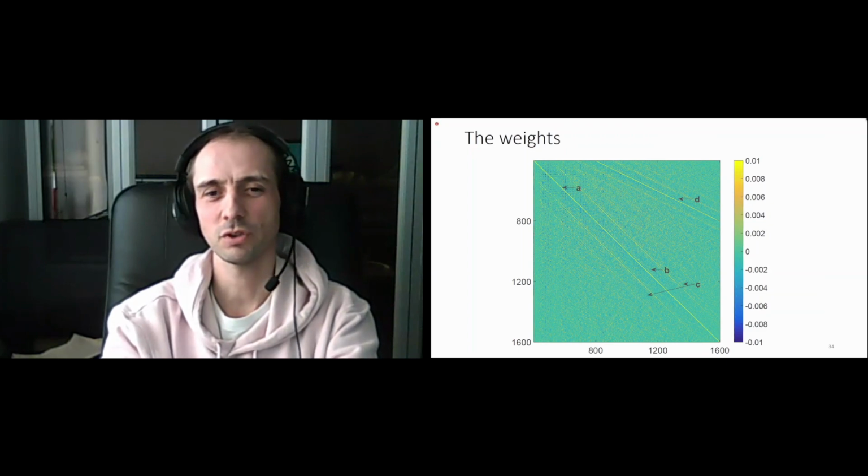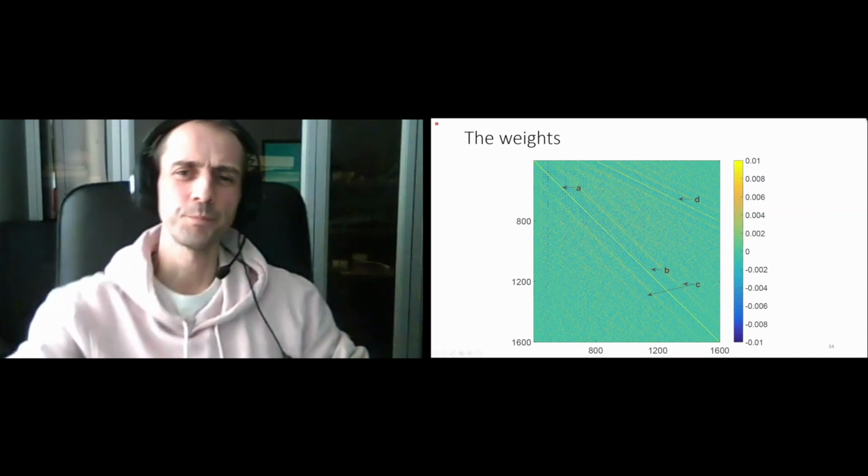Basically, you would need to train the model for each instrument, and you can pre-train. And what about the other models you're comparing your method to? You also need to train them for each instrument.